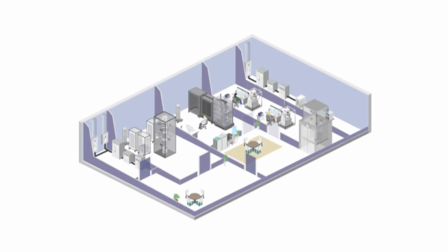Other changes in DC field sources, movement of large ferromagnetic objects, you can look at swivel chairs. If you move around on a swivel chair too close to the column, that can be problematic. But honestly, we see customers almost go too far trying to keep steel or ferromagnetic objects outside the room. So, we'll see customers write in the specification that there can't be any steel or metal on the hardware to the cabinets, the lab cabinets, etc. You could probably induce some sort of imaging issue if you open and shut a steel door to a lab cabinet too close to the column.